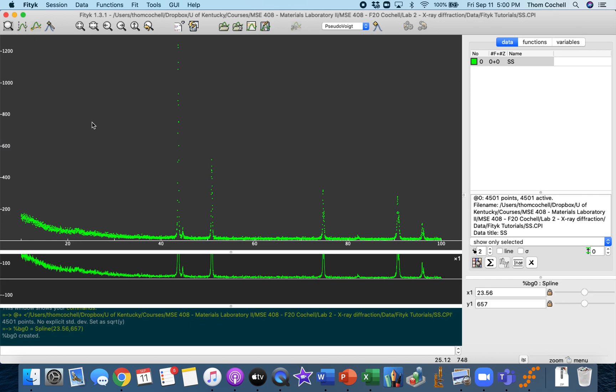All right, so the next task I want us to be able to do if the need arises is baseline subtraction. When we're dealing with X-ray diffraction and any sort of experimental data, there's going to be some background signal, and so baseline subtraction allows us to subtract out that sort of noise of the signal.